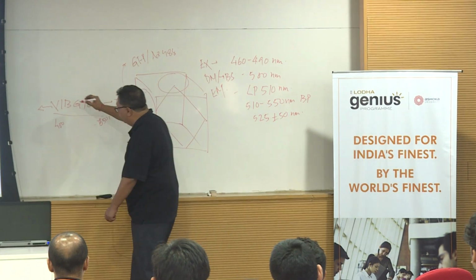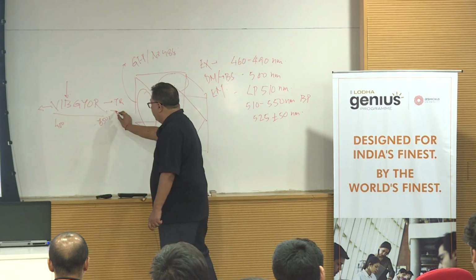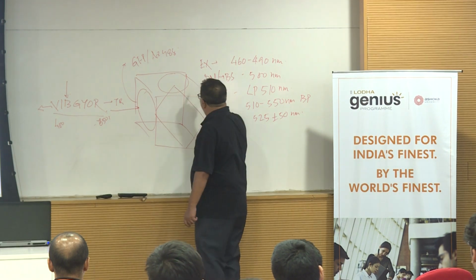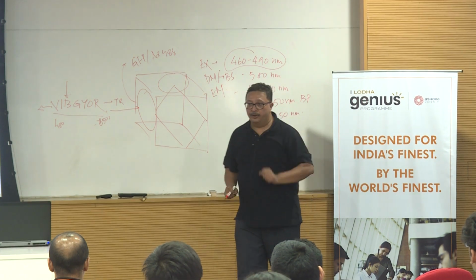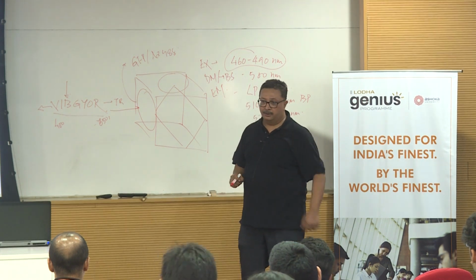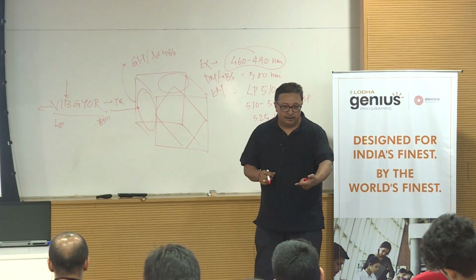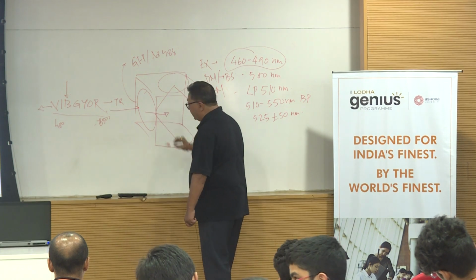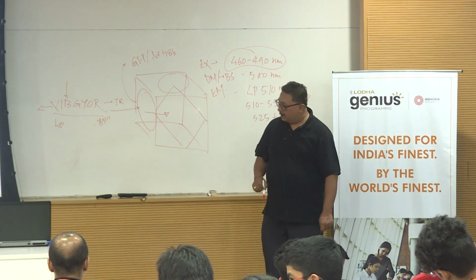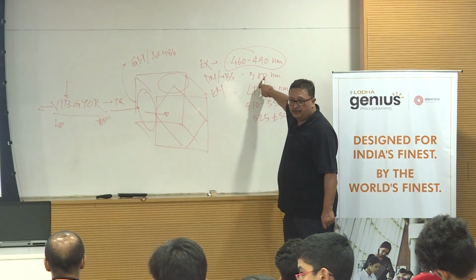Okay, let's say blue. Very good. So it means that whatever white light is coming over here, only this particular range of wavelength of light is allowed to pass. So your white light gets converted to a blue light. The blue light enters the filter cube, and here you have a dichroic which has a wavelength of what?